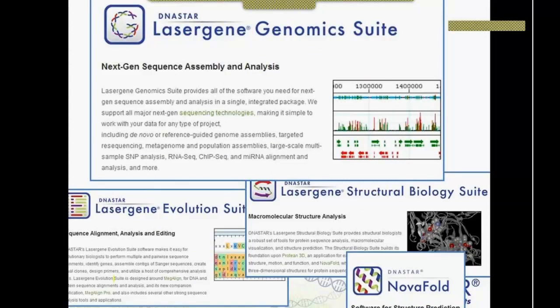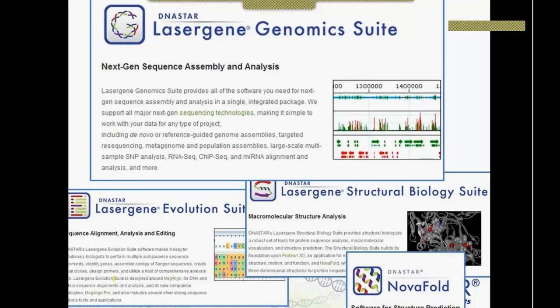Today we're going to be talking about the LaserGene genomics suite. There are primarily three software programs we'll be working with: SeqMan Engine for assembly, SeqMan Pro for visualizing the assembled data and doing primary SNP analysis, and ArrayStar for comparing multiple different assemblies. If I want to compare SNPs from control and cancer or from different individuals, or RNA-Seq, ArrayStar has those tools. We also have other tools providing things like phylogenetic alignment — our evolution suite — and structural biology protein analysis tools.